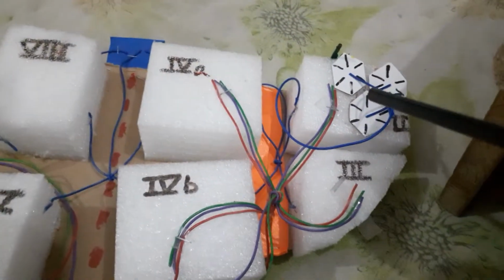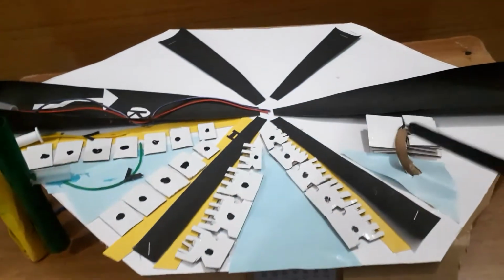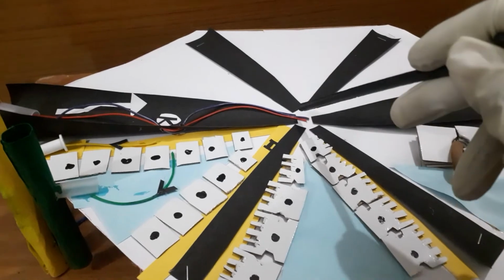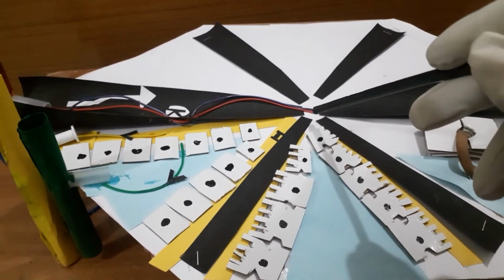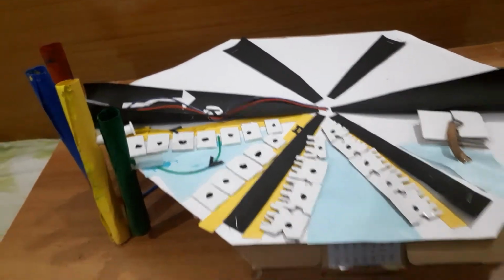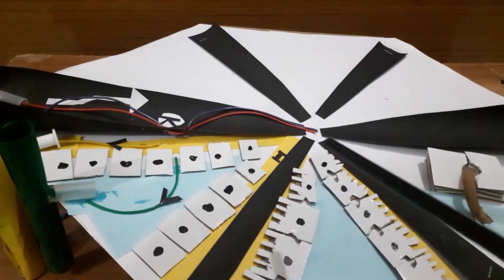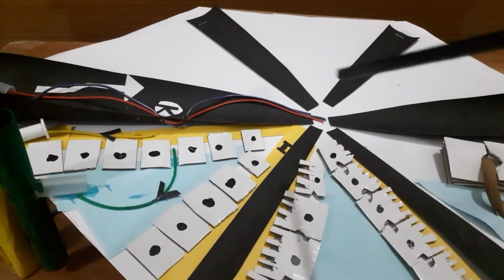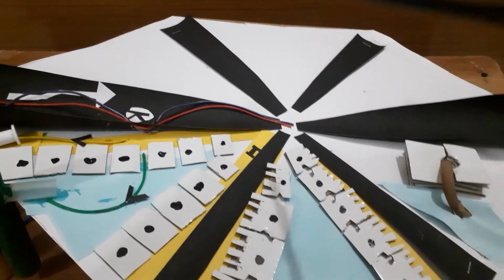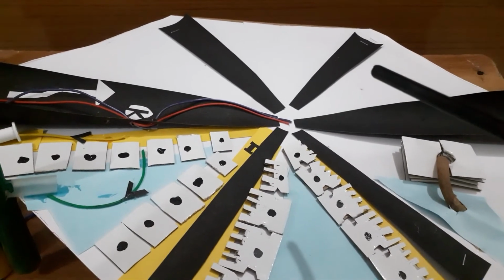Here the main role is played by the central vein. In the center is the central vein. Here is the general circulation. Through the classical hepatic lobule, we are showing the endocrine status of the liver.